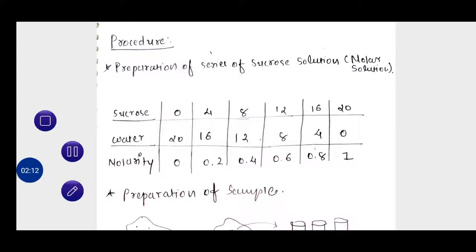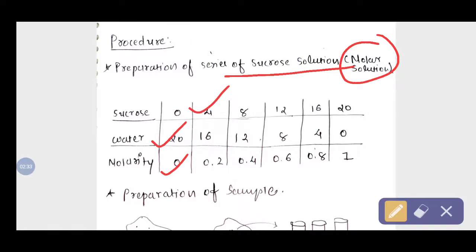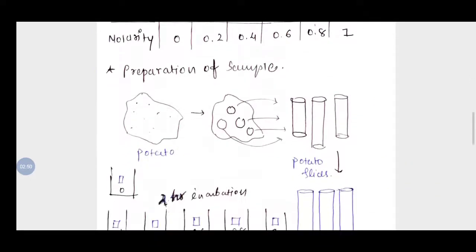Now the procedure. The first step is preparation of a series of sucrose solutions of different molarities. We take 20 ml of water in a beaker to make zero molar sucrose solution. In this way we prepare 0, 0.2, 0.4, 0.6, 0.8, and 1 molar solutions of sucrose.